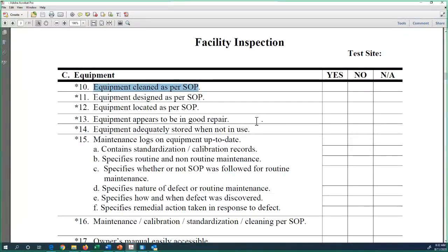If you shake at 60 revolutions per minute versus 300, then you need an SOP. If it's not so important, just say 10 to set it to maximum, 10 to set it to middle, that should be fine. And the same thing with the stopwatch. You grind your sample for 5 minutes, and is it accurate enough? Is it 5 minutes, or not 5 minutes and 1 second, or not less than that? But in this case, that's not important because you have enough time. So it's your judgment call.